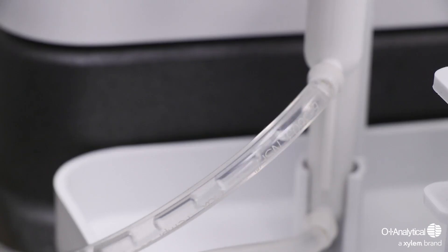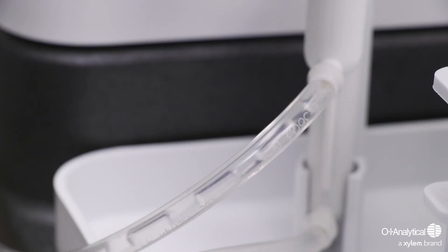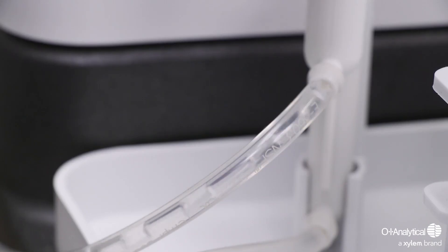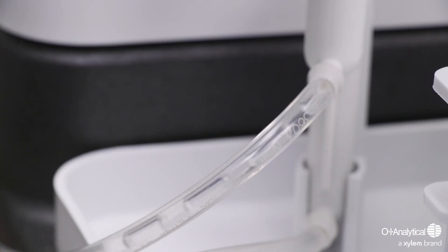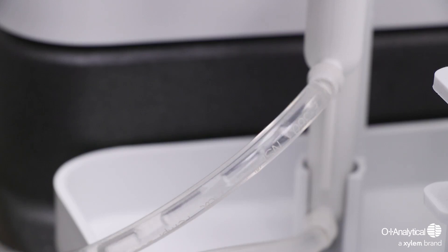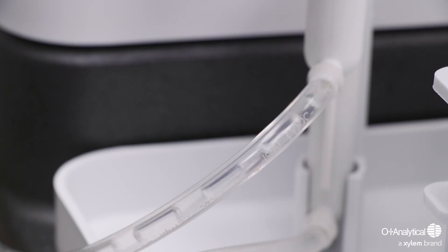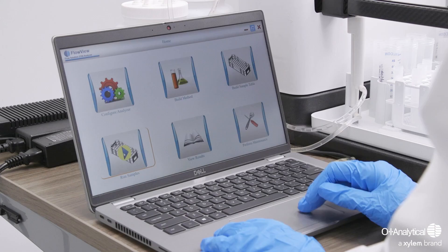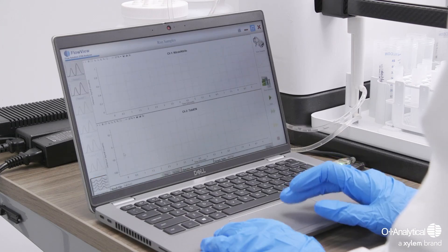This device allows manufacturers, scientists, technicians, and other professionals to identify contamination sources and implement preventive measures.